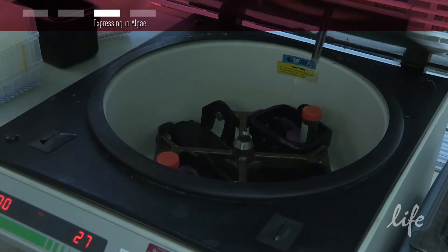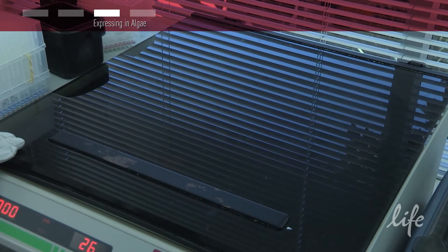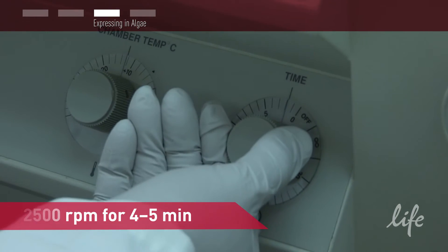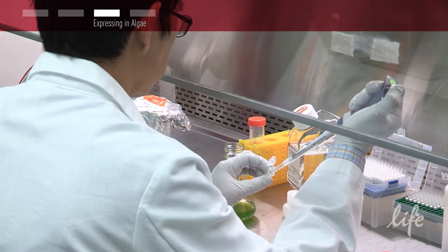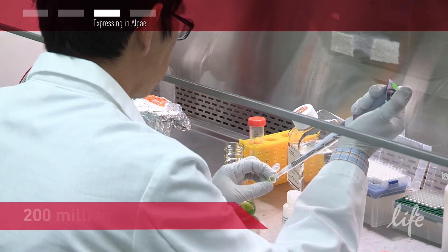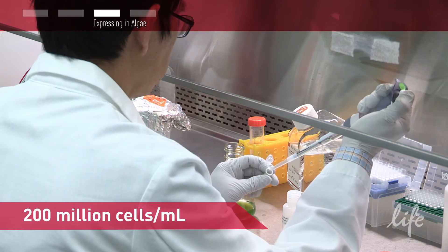When cell concentration reaches 1 to 2 million cells per ml, harvest them by centrifugation in a 50 ml tube at 2500 RPM for 4 to 5 minutes. Next, wash the pellet twice with 10 ml of Geneart Max Efficiency Transformation Buffer, and then resuspend in Transformation Buffer to a final concentration of 200 to 300 million cells per ml.